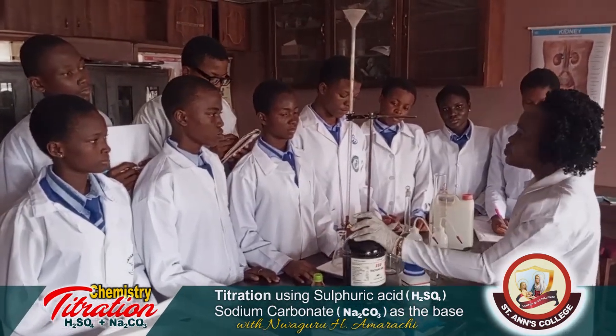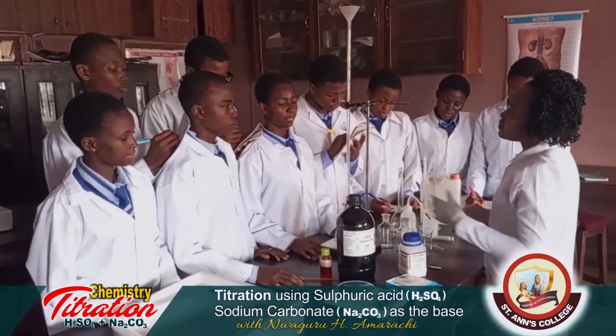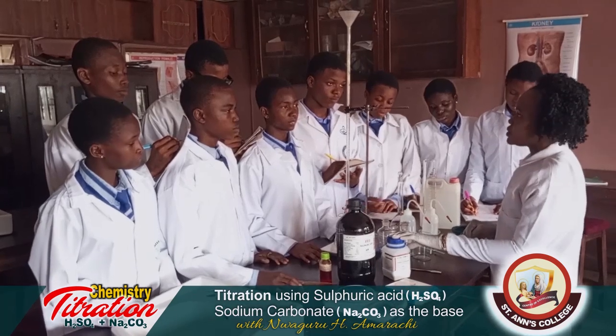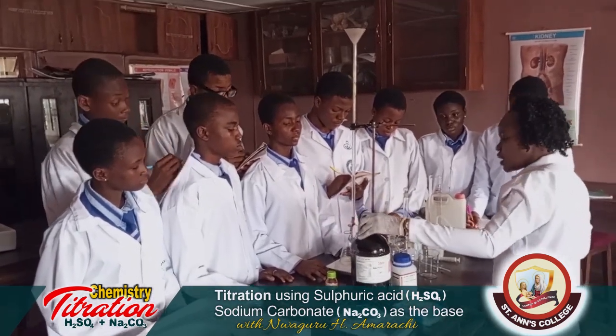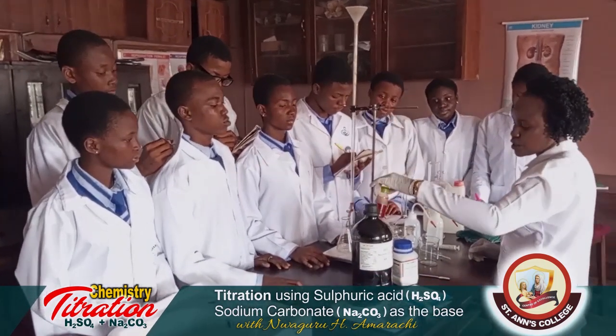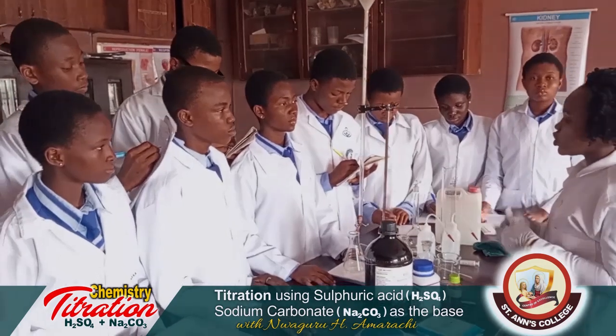The acid we are going to use is sulphuric acid or tetraoxosulphate acid. Then our base is sodium carbonate. We have our indicator as methyl orange. This enables the endpoint. One will see a color change.